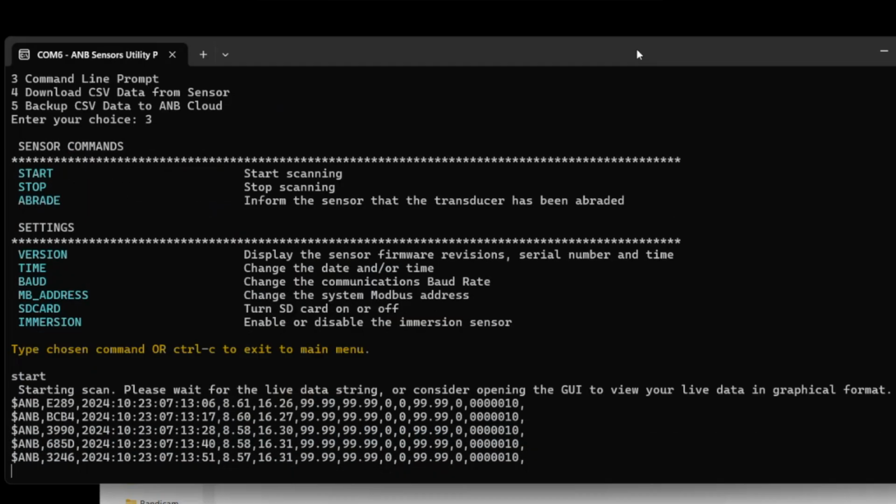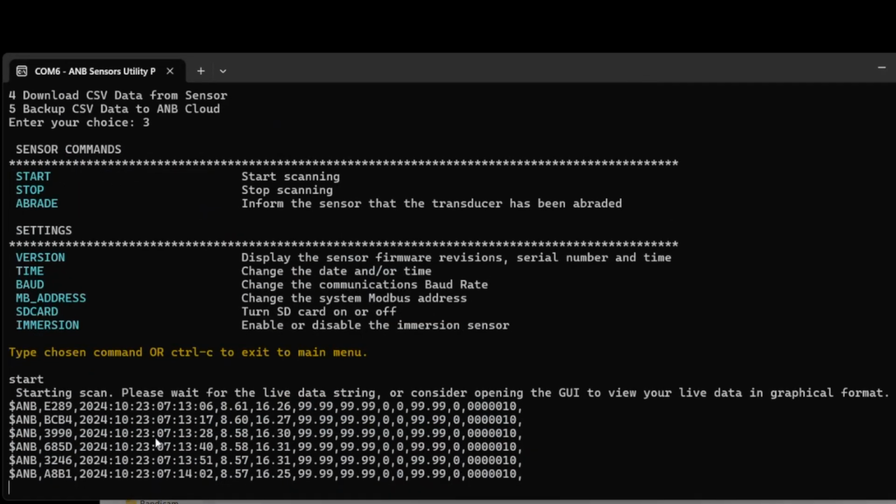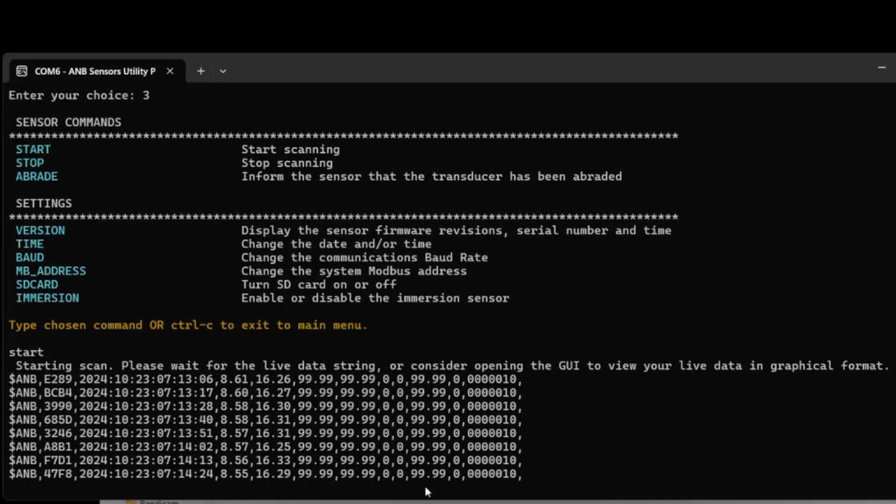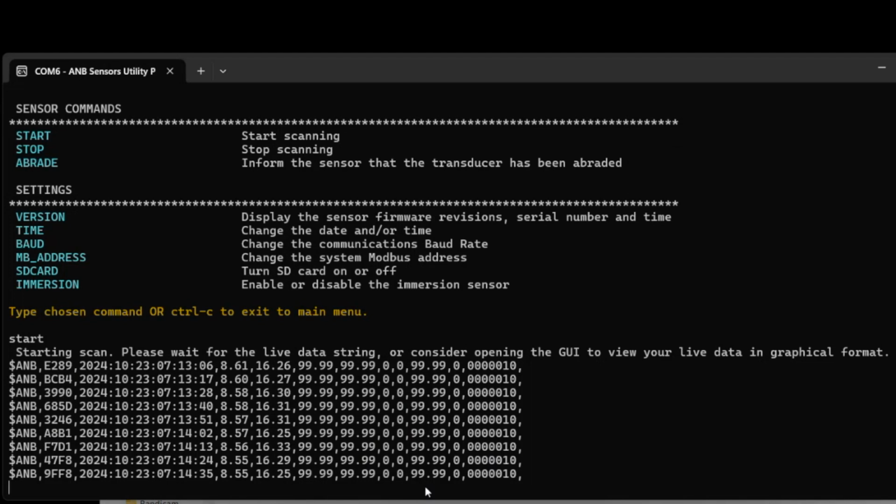The sensor started to show the data. The output information is all on our website, but we've got pH here, temperature, then salinity and conductivity, which are 99s because it's in seawater. If it was in freshwater, we'd have some numbers here. We've also got this new column of data here, which is actual conductivity. So we generally give out specific conductivity, or we used to. Now we give both specific and actual, so temperature compensated and actually compensated to the temperature that you're measuring.